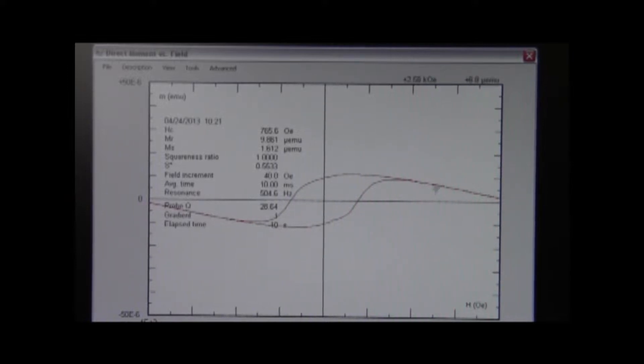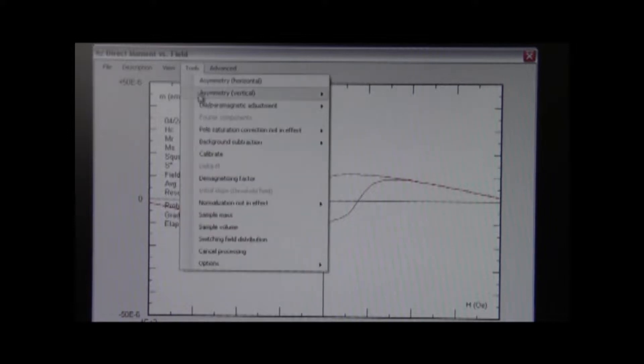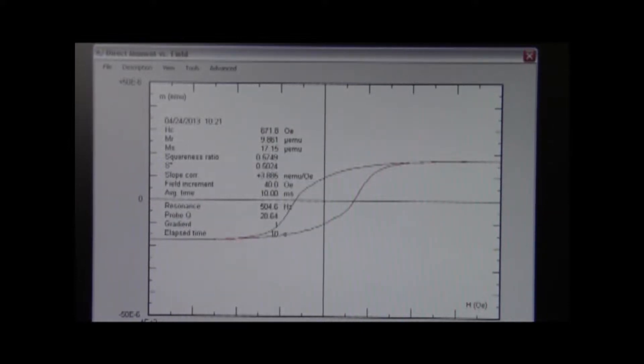As you can see from here, there's a diamagnetic background, and that's due to the AGM probe itself. We can remove that using the software, which is what I'm doing now. And there you have the corrected loop, and here again, you can see the saturation moment is about 17 micro-EMU. The remnants is just below 10 micro-EMU, and the coercivity is a little over 670 URSTED. And you can see here, the data acquisition measurement time for the entire loop was 10 seconds.